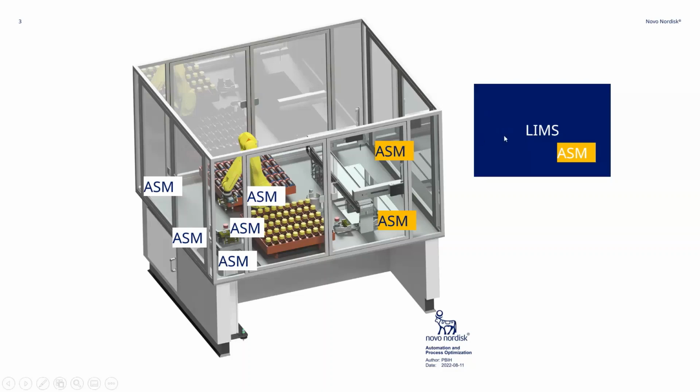We also try to use the same philosophy to connect to LIMS. We did some modeling for the communication in and out from LIMS. A PC controls everything, and also controls the communication towards our LIMS system.